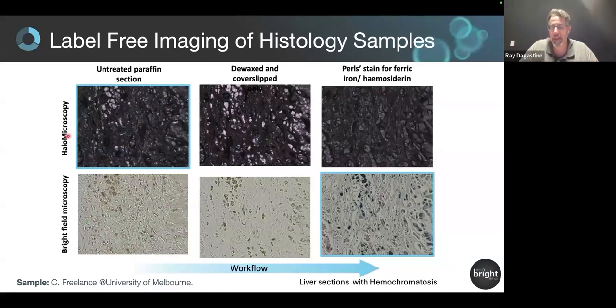And one of the other things we're working on exploring is stacking tissue sections as well, as something we're interested in working with Chris Freelance to see how this might fit as a tool to complement or fit into some workflows where maybe it's a little bit harder to do staining. Or, you know, the crazy one was, could we do this where you could slice in theater and look at something quickly? And so we're still nutting out that potential. So we're looking for ideas in that.